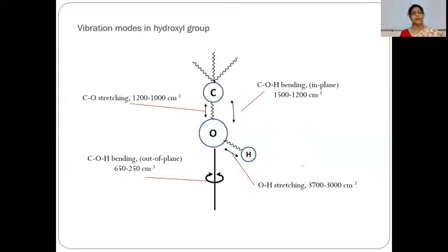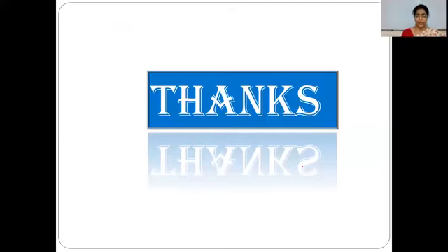It means in a molecule, the number of vibrations depends on the number of bonds present in the molecule. Thanks a lot.